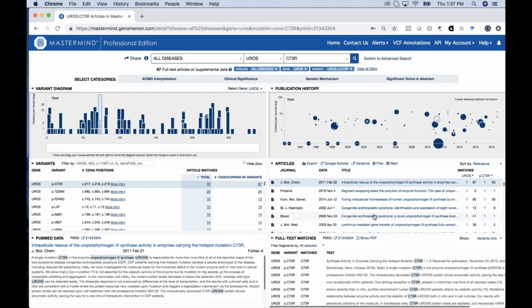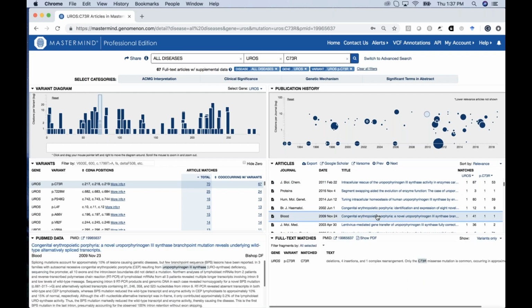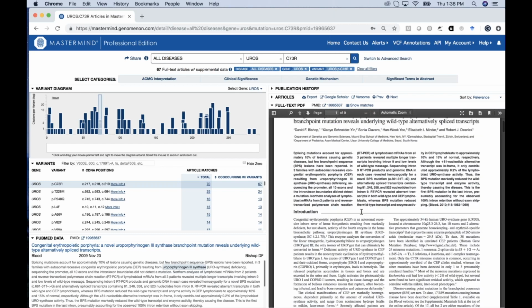or if I identify a reference that I'm really keen to identify and interrogate, I can click on it directly or toggle to it. If, say, this particular sentence or set of sentences is particularly interesting to me and my clinical question, and I want to take a deeper dive, and I've installed a Google Chrome extension and have access to that content, you can see how this was presented through the web browser in the Mastermind interface just now. If you have access to that content, you can click on and see and interact with that PDF using a variety of these PDF tools.